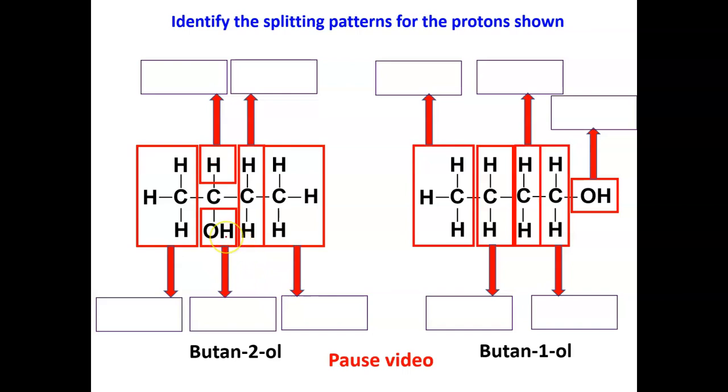The OH group itself, as a rule, is never split, because it's a hydrogen bonded to an oxygen, and not a carbon. And that is only ever a singlet peak. OHs are only ever singlets.